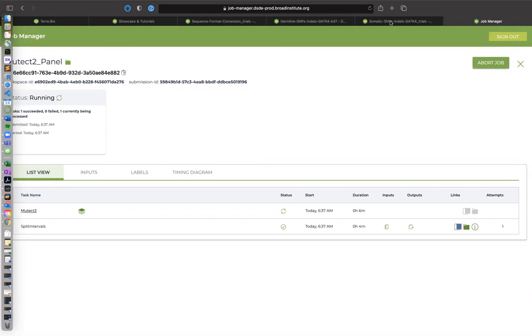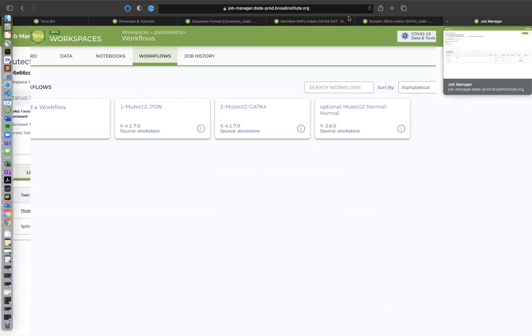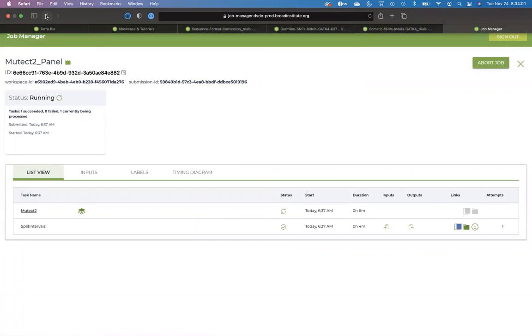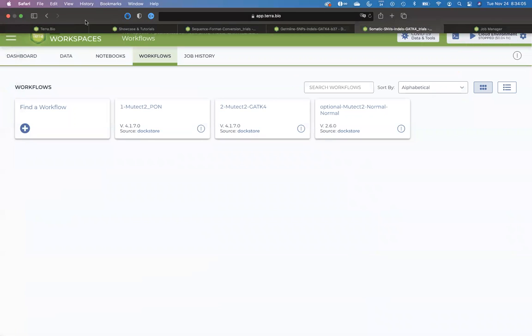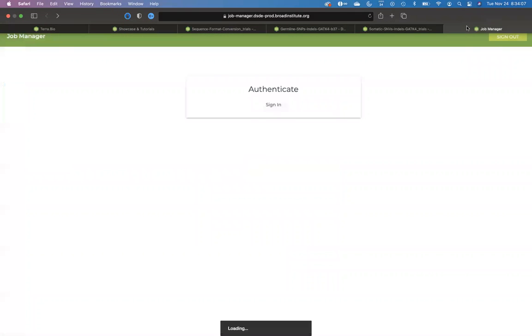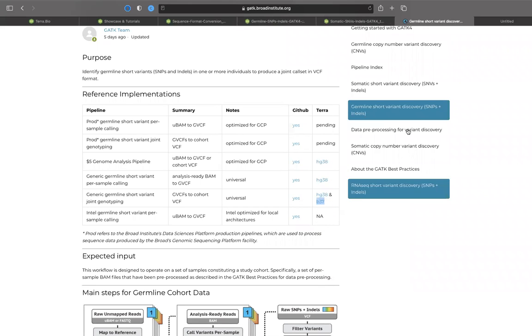Alrighty. Just know what I was looking for. This is session before. Right, so we're going to click. Let's see what opens.